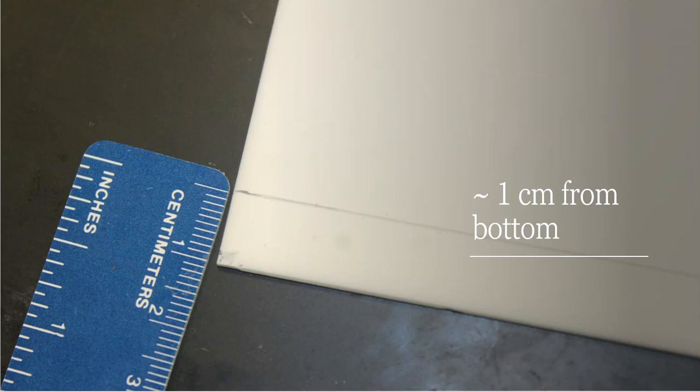And you're going to do that all the way across, and you're going to draw a line. So what I'm doing here, you can see this is a pencil. And the reason I use a pencil is because pens have ink, right? And the ink is organic, and the ink is soluble in the solvents almost every single time. What you will see is that the ink pen will smear and it will run all the way up the TLC plate. And you have just ruined the plate because you've marked it with a pen instead of a pencil.